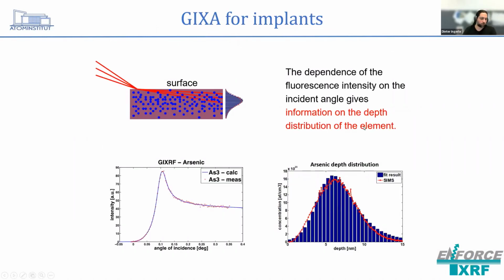So that was one example, which is one of the first problems I came across when I started my master's, building this chamber and then analyzing arsenic implantation in silicon, so characterization of arsenic implantation in silicon and how to evaluate this. In principle, it's the same approach as I've shown you before with the layers. In this case, we just discretized the implantation profile and calculated our model from this.